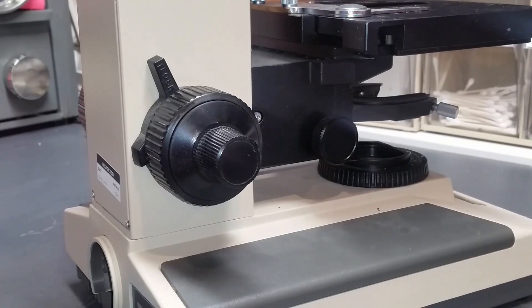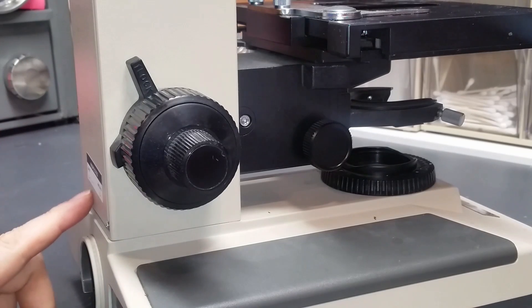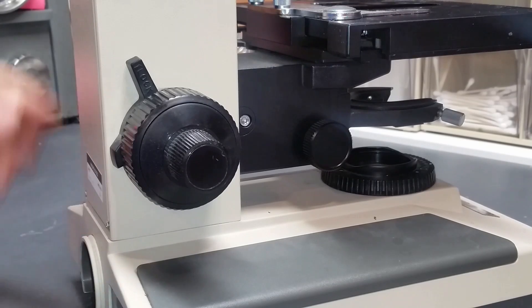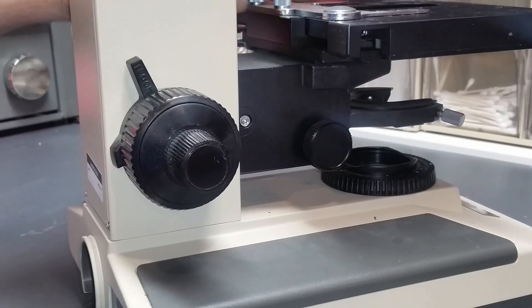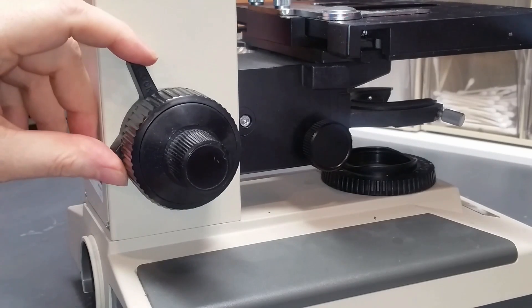Hi and welcome back to the Empire of Dirt workshop. Today I'm going to talk about the preset stop mechanism on a BH2 scope. This specifically is a BH2 scope. Please disregard the condition of this scope — it's just an old scope desperately in need of a cleanup and service. According to the stickers, it was last serviced back in 1997, and the mechanism and stage are very stiff. But none of that matters today because I'm just going to talk about this preset mechanism.